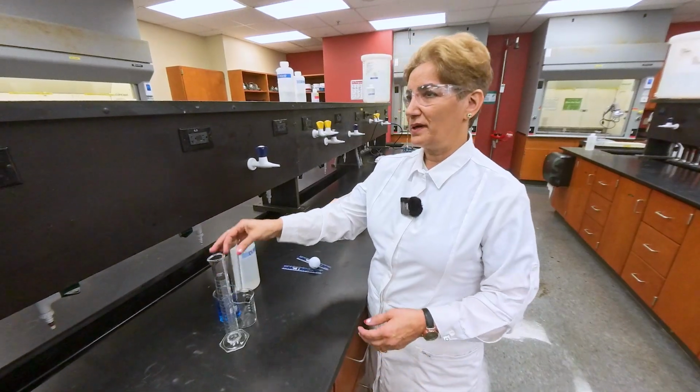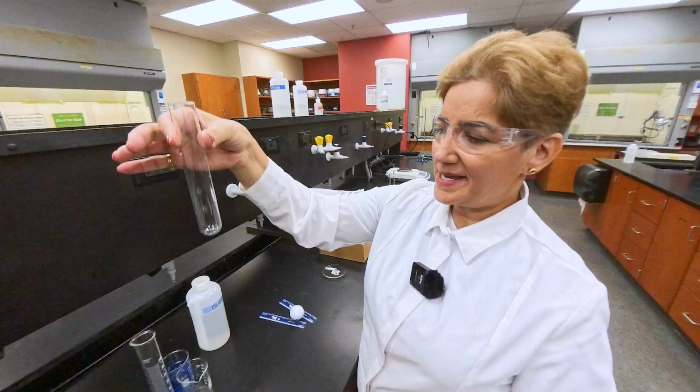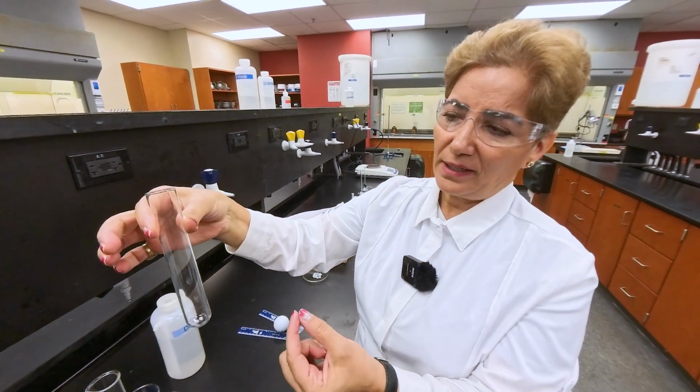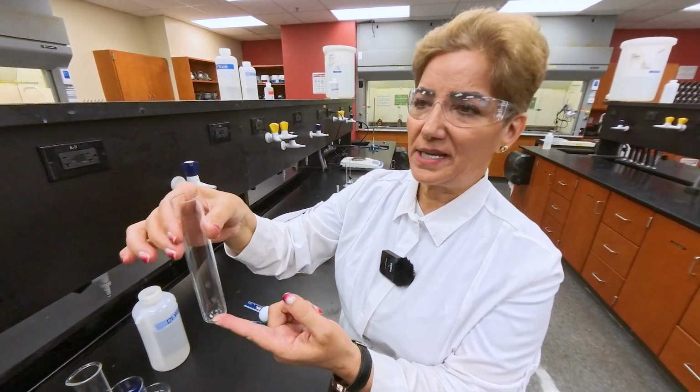Next part, part 2.2, we are going to measure the volume of the test tube. A test tube is not a perfect cylinder, so one technique we can use to measure the volume is to see how much liquid it can hold.